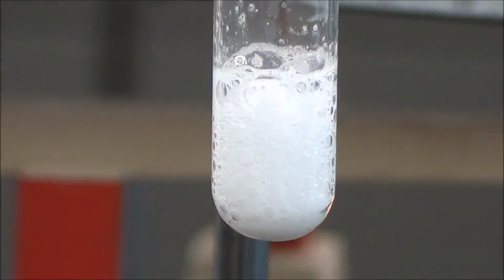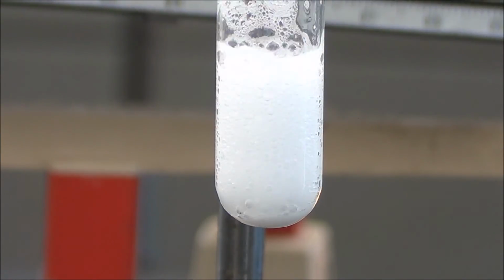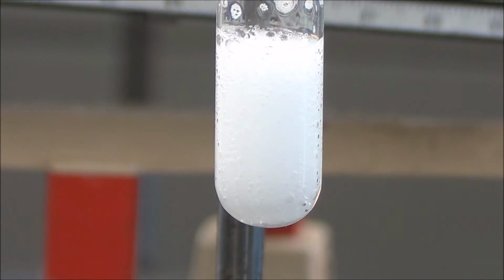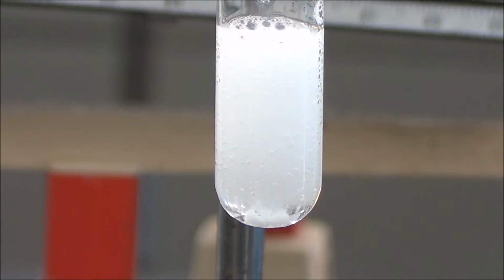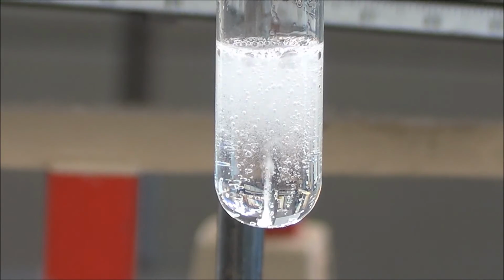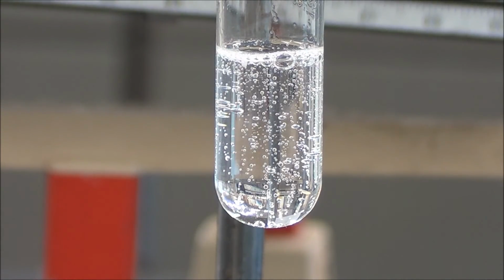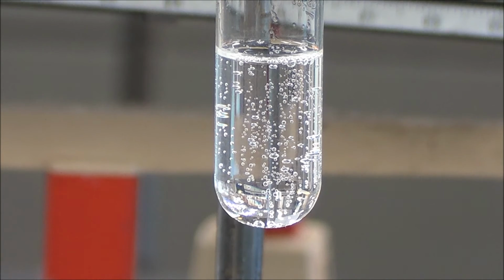Now I'm adding hydrochloric acid, and notice I just keep adding it. As I add it, then you see the gases. The gases coming out are carbon dioxide. That's just leaving. So that's mass that's going away. The water is still staying behind, and so what you have there is a solution. It's mostly water, but there's going to be some sodium ions and some chloride ions.